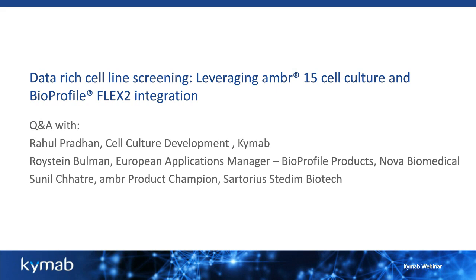So we just have a few more questions coming through. Are there any major engineering considerations for the Nova Flex integration with ambr15? Did you have to redesign your laboratory? Let's start with you, Rahul. Yeah, so you need to consider where all the different pieces of equipment are going to go. Before you buy the kit and it arrives in your lab, I would expect that you make appropriate arrangements for that.